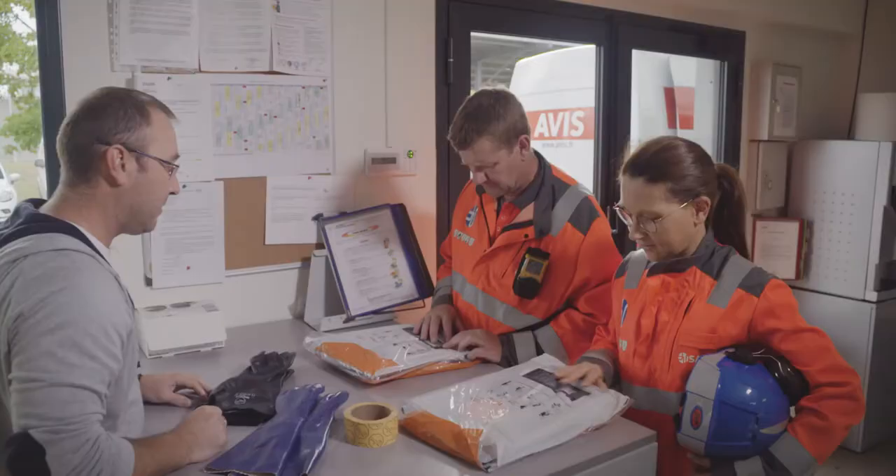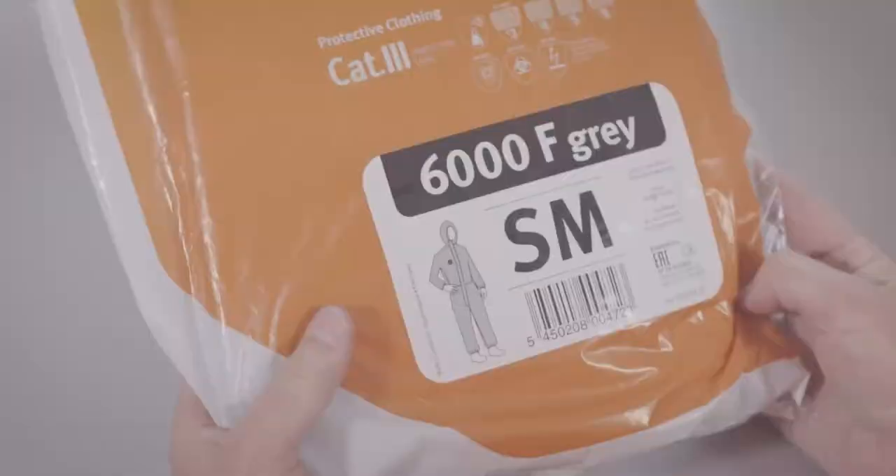Bring everything you need — coverall, gloves and tape — to the garment donning area. Make sure you choose a coverall of the correct size that matches your body height and your chest girth. Only properly fitting clothing can give the user comfort and full protection.